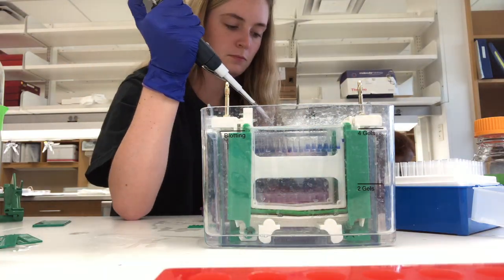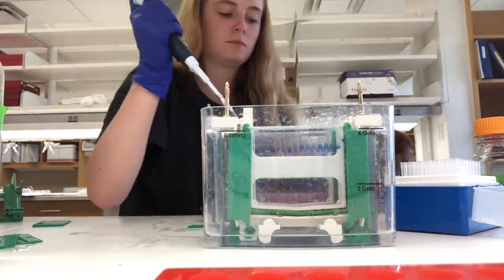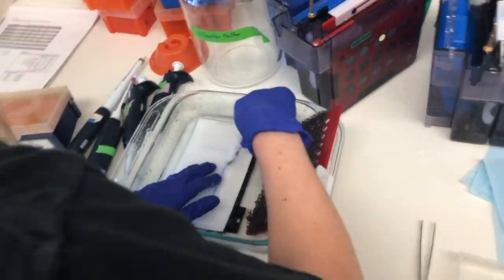After more washes, we added sample buffer to the samples so we could load them into our gels. Once we ran the gels, we transferred them to membranes, added secondary antibodies to them, and then performed a western blot where we developed our membranes onto film to see the different bands of protein.